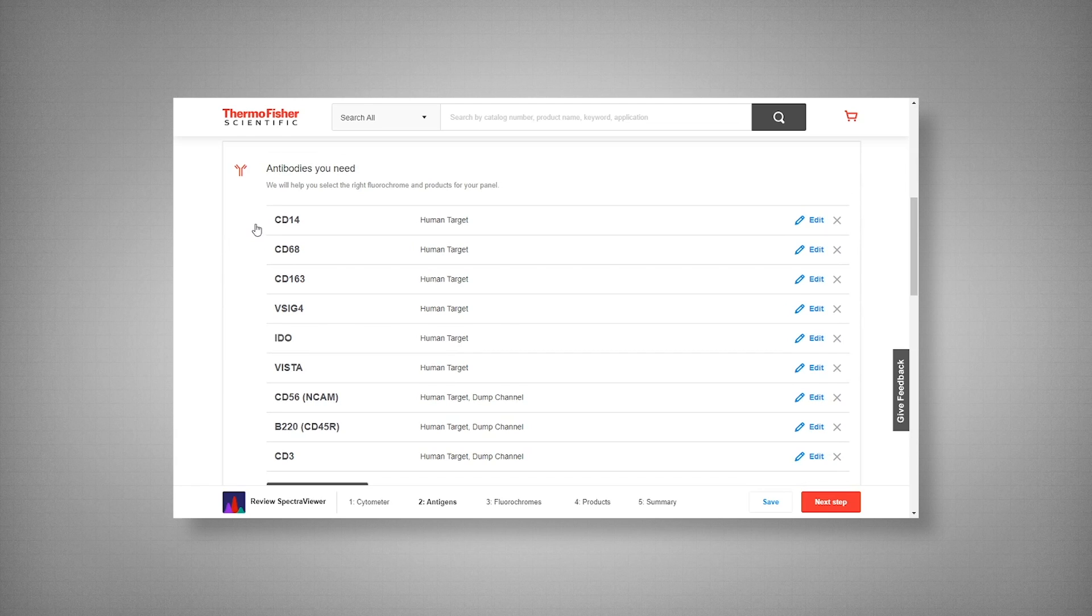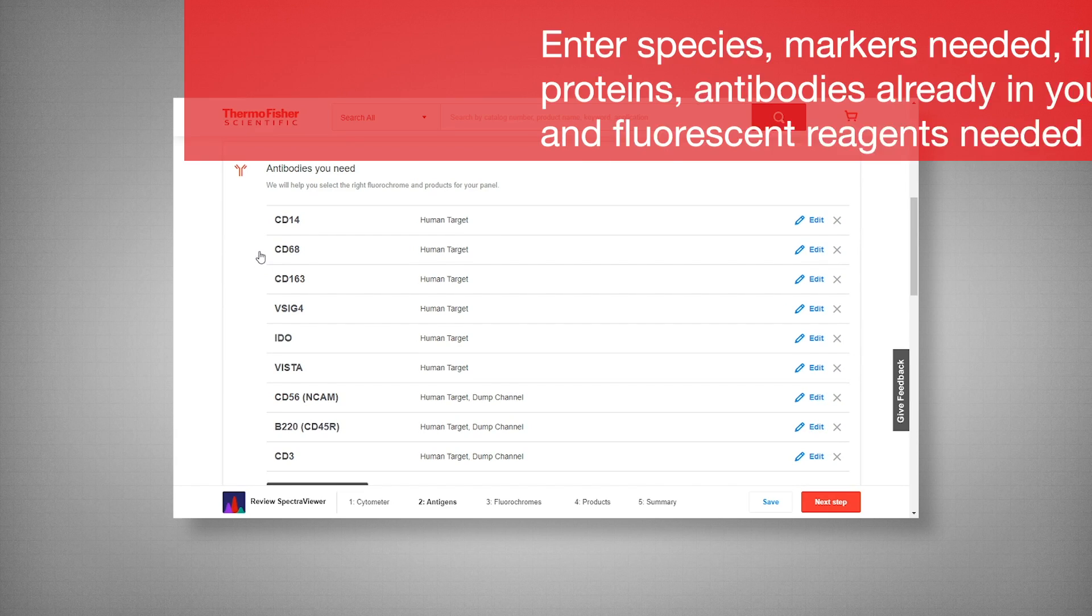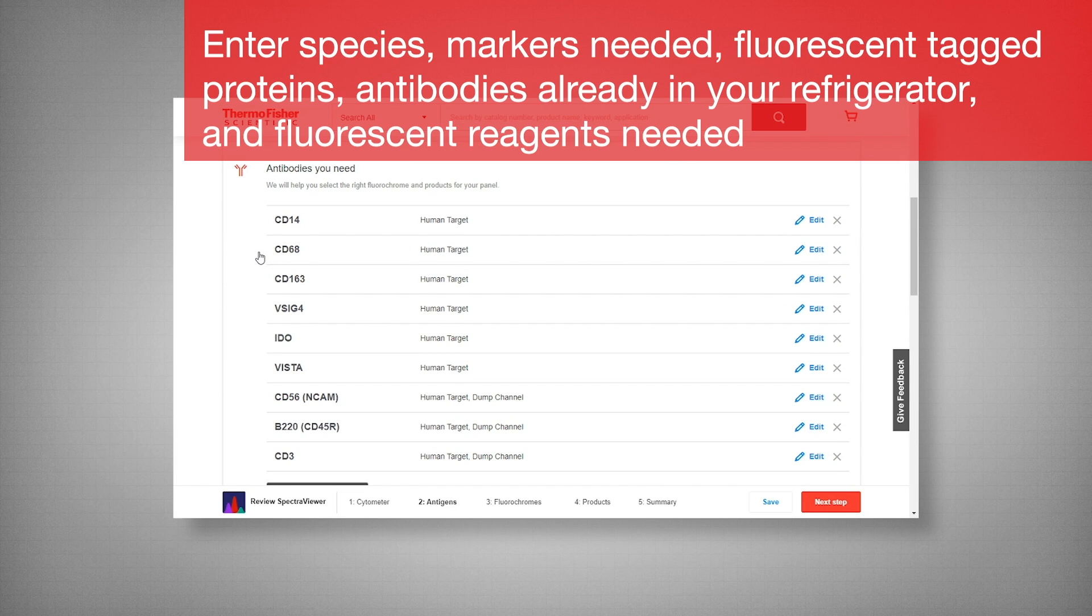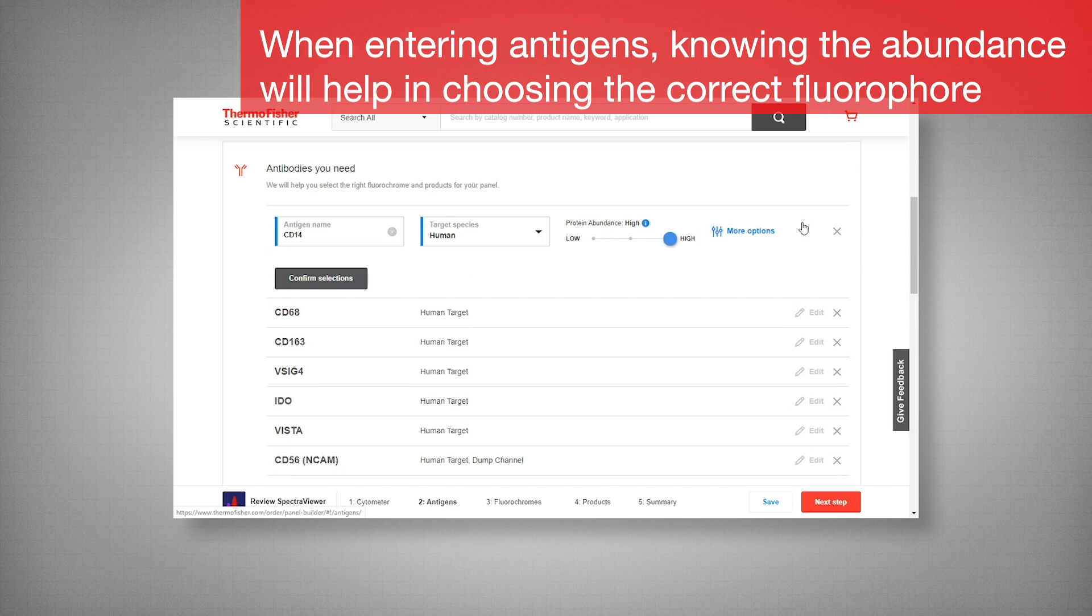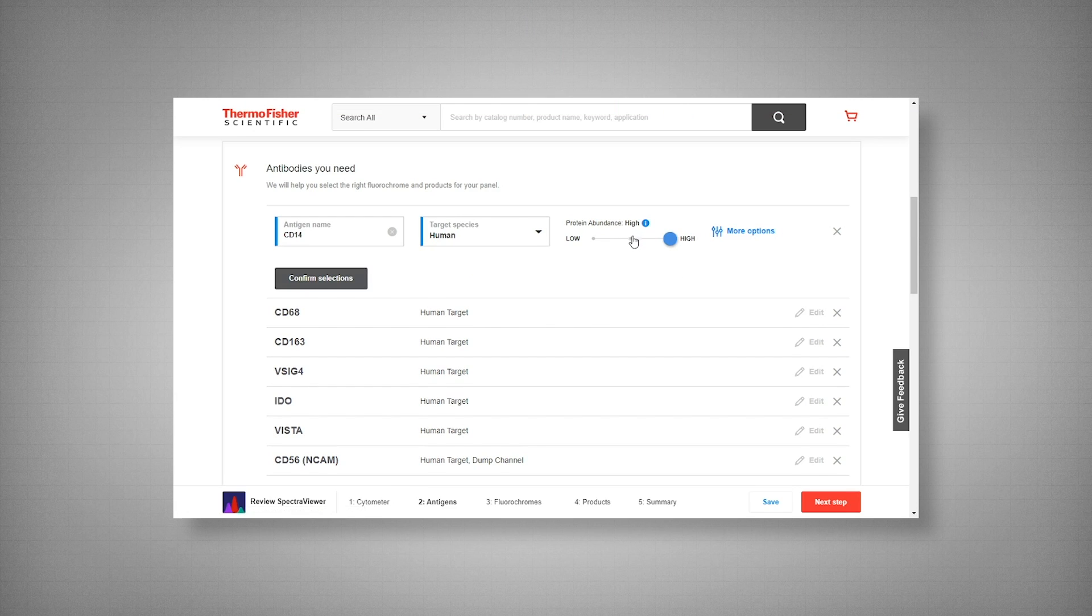Here I have CD14 and CD68 as my general phenotypic markers. Now when choosing your markers, you want to pay attention to your protein abundance, as that will come in handy when you're choosing your fluorophores. If it is unknown, simply leave it on medium. I have set both CD14 and CD68 to high.